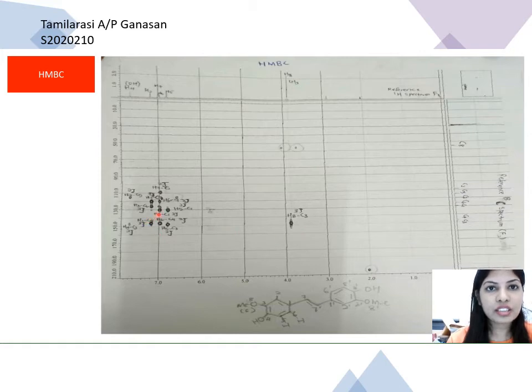So they have another 3 nice cross-peaks here. H2 correlation with 3 nice peaks, C7, C6 and C4. Okay, next move to H7 correlation with C2 and C1. Then H6 correlation with C4 and C6. Let's jump to H5. H5 correlation with C5 here and C3 here.